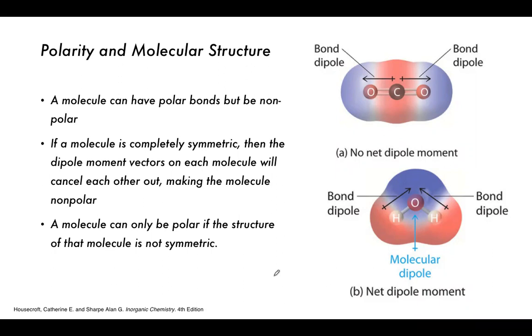Carbon dioxide is the one on the top, CO2. It has polar bonds. Carbon and oxygen have different Pauling electronegativities. These Pauling electronegativities mean that carbon will be slightly more positive than oxygen. And that means that the dipole moment, as you can see here, is written with the chemistry tradition from the positive to the negative, although the IUPAC dipole moment will go in the opposite direction.